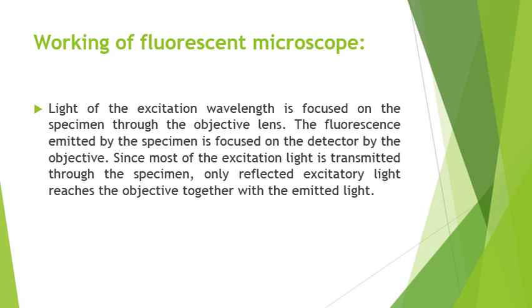components. Illumination light is separated from the much weaker emitted fluorescence through the use of an emission filter, and the filter and the dichroic mirror are chosen to match the spectral excitation and emission characteristics of the fluorophore used to label the specimen. In this manner, a single fluorophore is imaged at a time, and multicolor images of several fluorophores must be composed by combining several single color images.